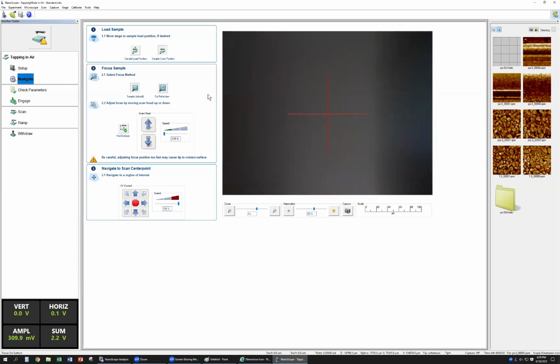This is sapphire. Okay. Then we take out this sapphire and the two percent. This one. So for example, this one is my sample. Then I just put it inside here.